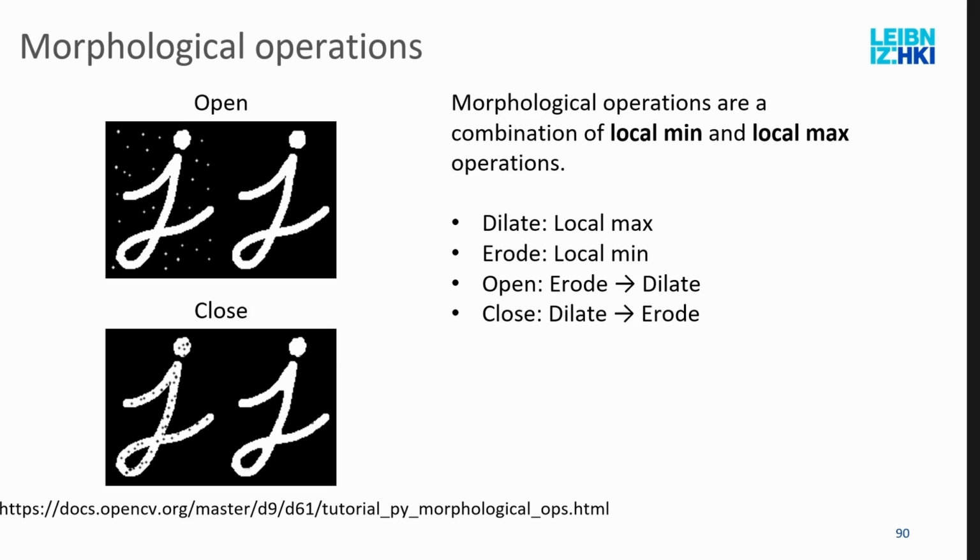And then a related operation to it, the morphological closing, which closes holes, which basically is just the opposite. I first dilate it, which would basically inflate the whole object, but also inflate the object into these holes here. Then they are closed, and then when I erode it again with the same size, then the original object is restored, more or less.